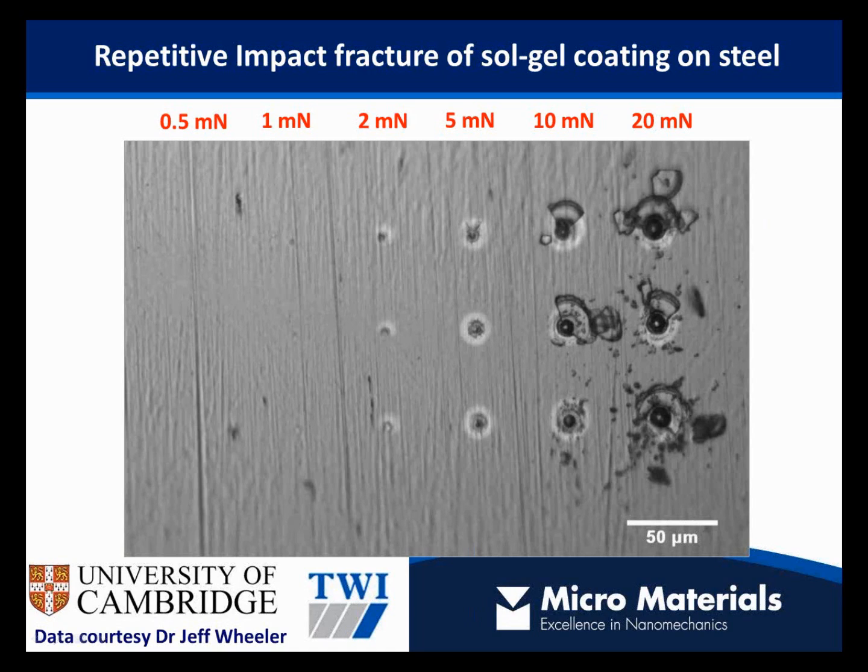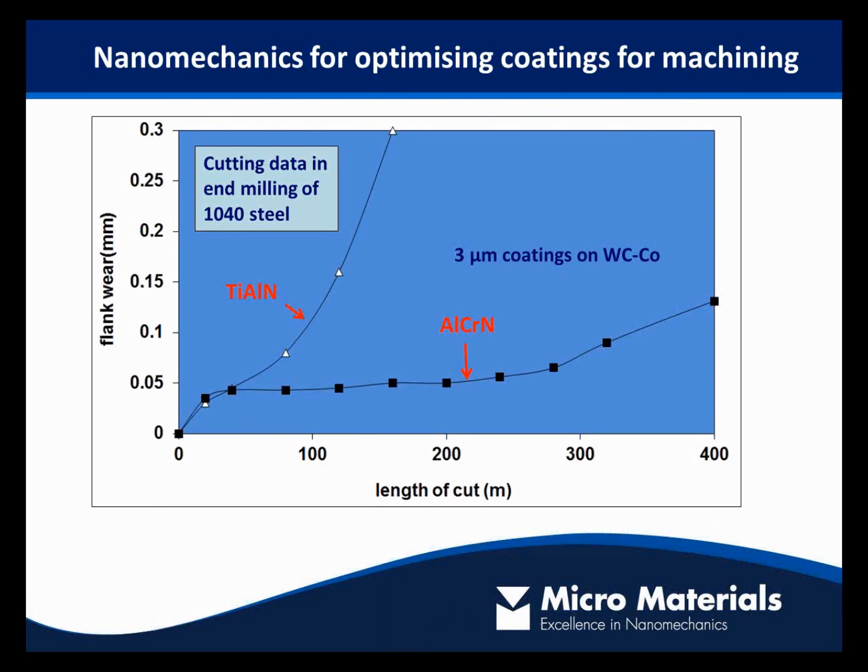And actually what they were able to do in this study was separate out fracture from delamination at the interface. By using a spherical probe, they're able to delaminate the coating without plastically deforming the coating or the substrate first. And that's really quite a useful thing in an adhesion test, because most adhesion tests are complicated by plastic and elastic deformation in the coating and the substrate.